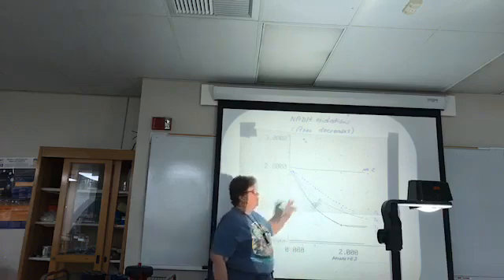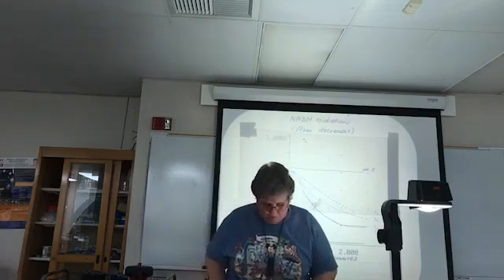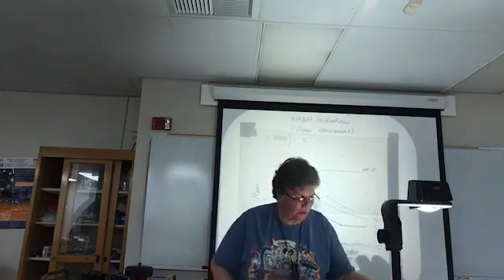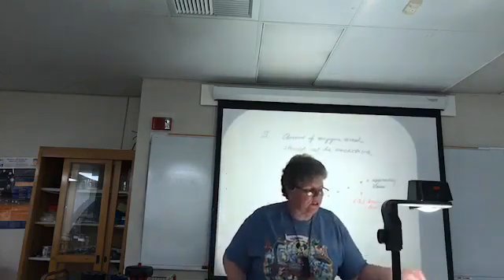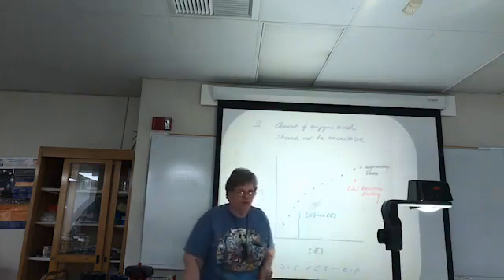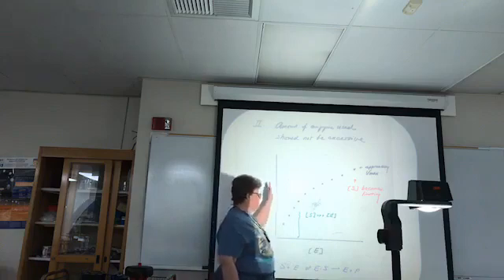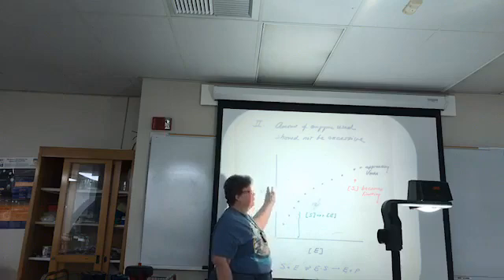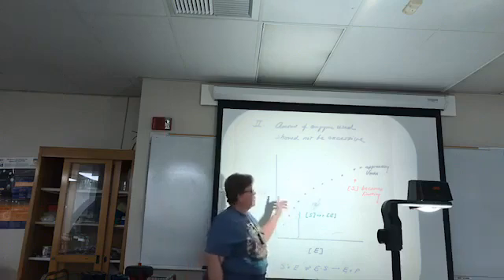So what we're really measuring in part B of the reaction is we're making sure that we are in a linear range, that we have not yet added too much enzyme for the amount of substrate. So part B of the experiment, you're going to be increasing the amount of enzyme and doing that reaction all over again, to make sure that you don't have excessive enzyme. Then you're going to graph velocity versus the enzyme concentration. So remember, you're going to use the extinction coefficient to turn the absorbance per unit time into a velocity.